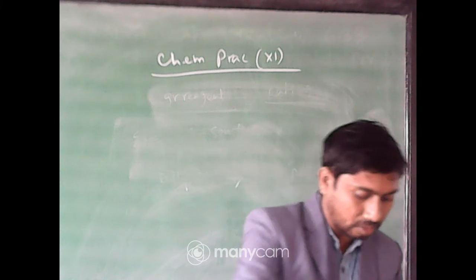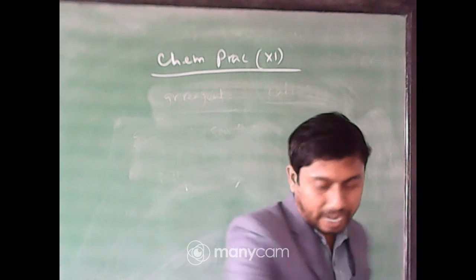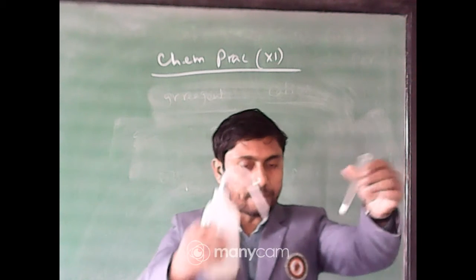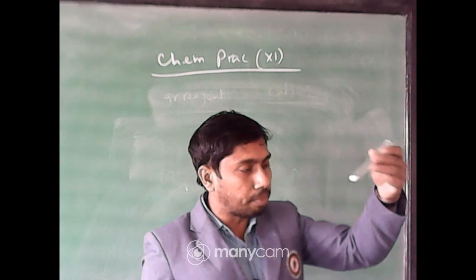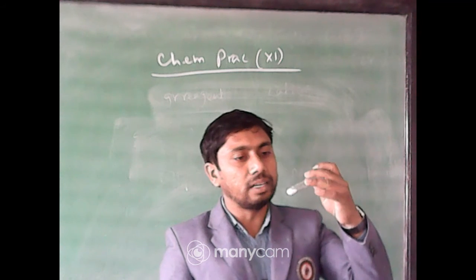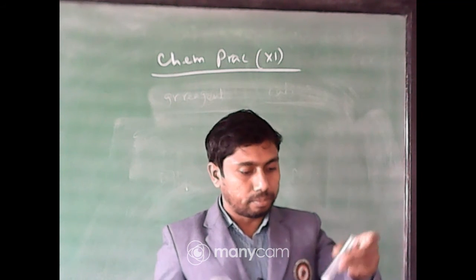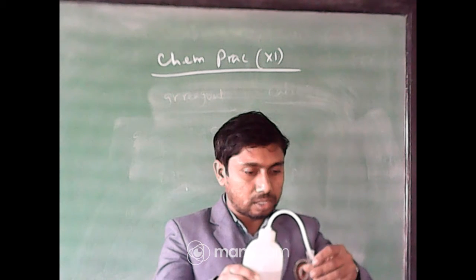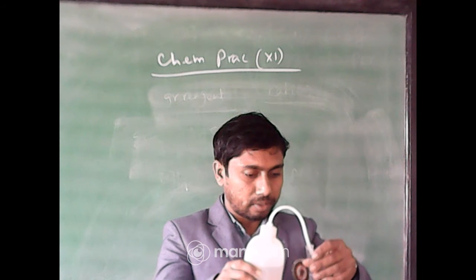Sample was taken, then add water to it. You can see that the sample is there, the solid white sample. What is the texture of that sample? It is crystalline white. Okay, add water to this to make the aqueous solution.